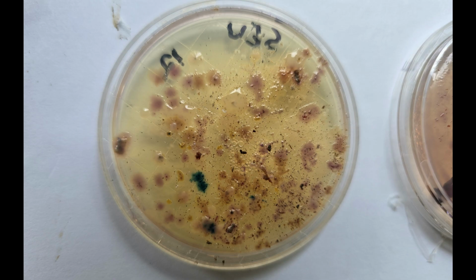But it's not. Those coliforms built up in that dust over time because they come in from the outdoors. They come in from the soils. And then, of course, you're going to have a couple E. coli here and there, because we actually all have E. coli in our dust in our houses because we flush toilets. And so that's actually a pretty normal looking old dust test.